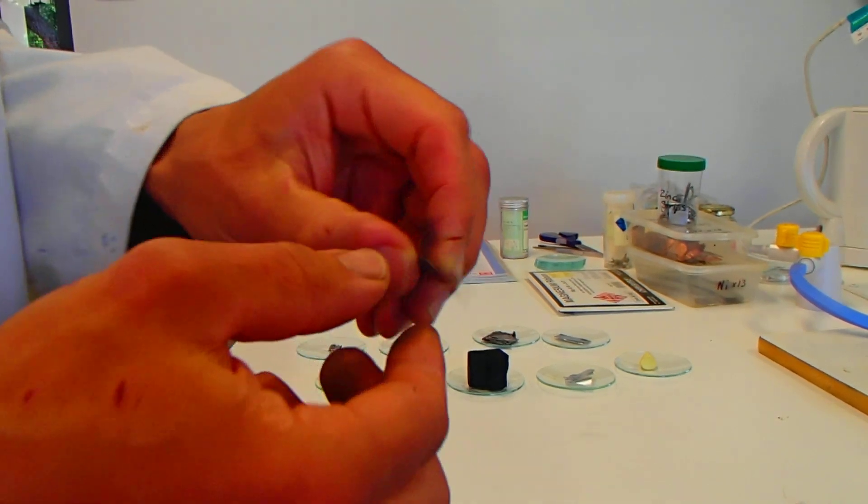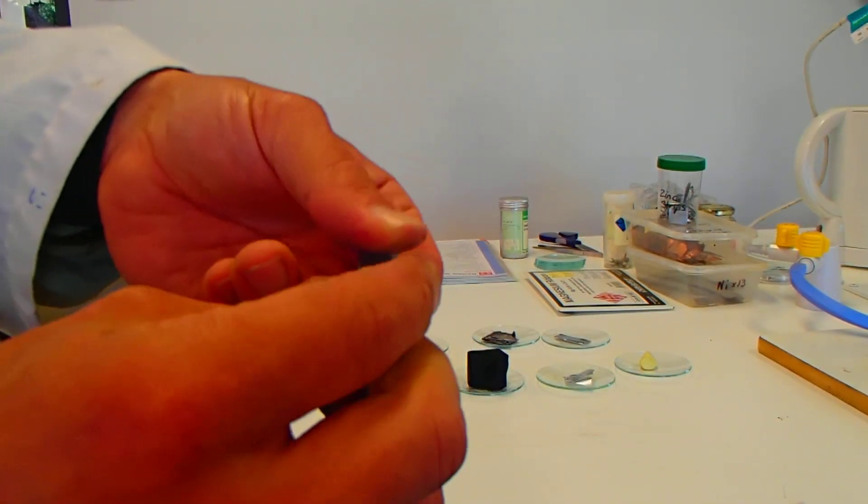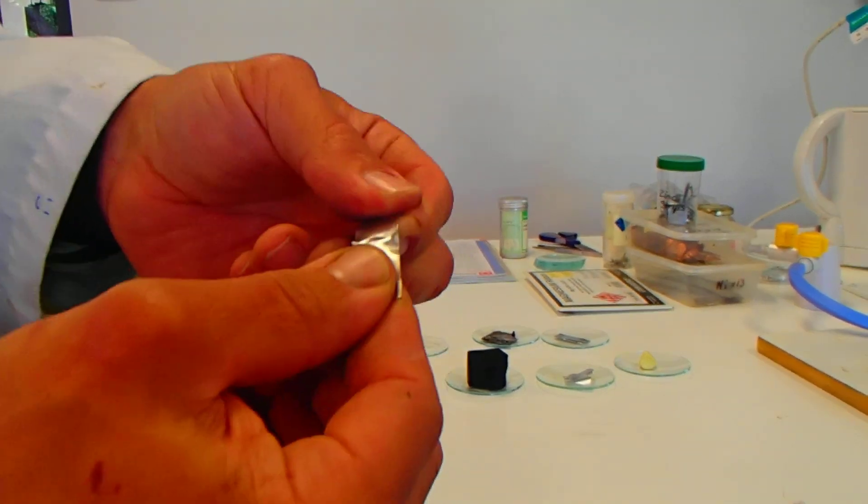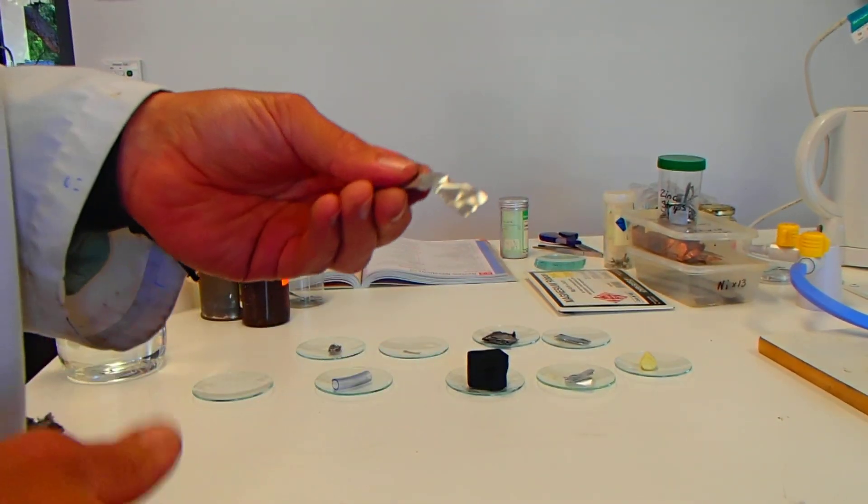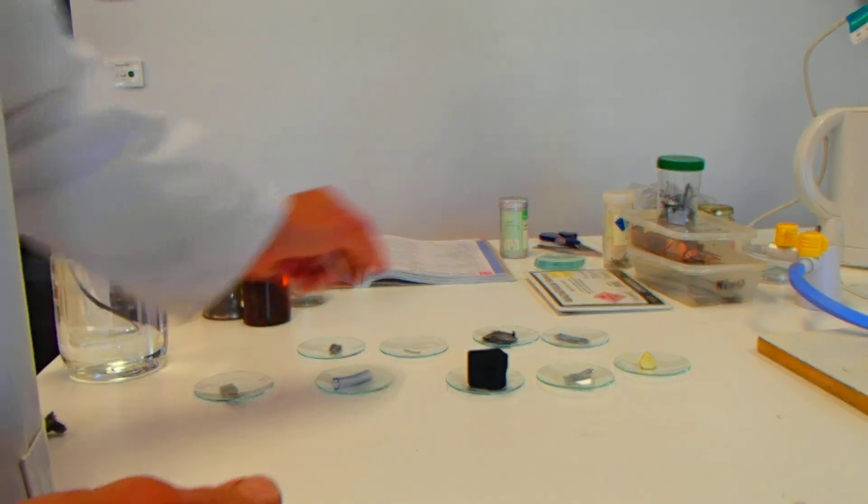Moving on to the tin. Easily bendable, similar to the aluminum. Keeps its shape when bent. Doesn't crumble. I can't really tear it as easily as aluminum. So not really tearable, but definitely bendable. Again, you should be writing down all these properties in your results table that you have in your book or online.